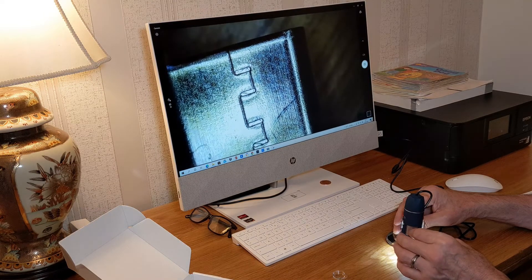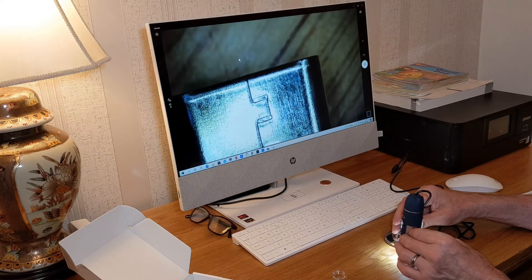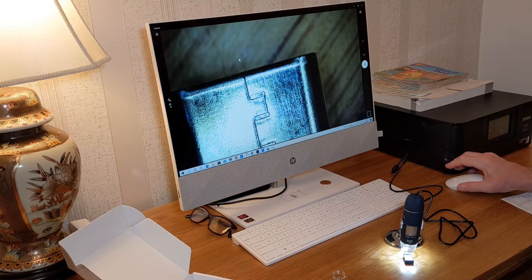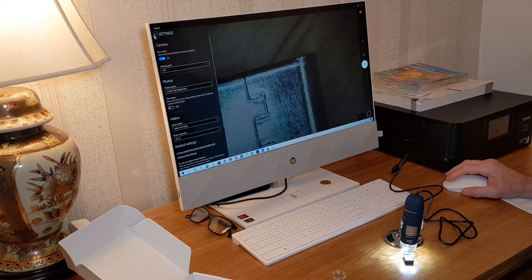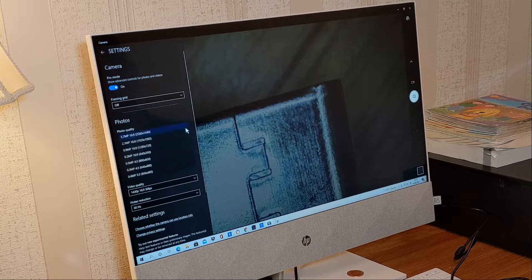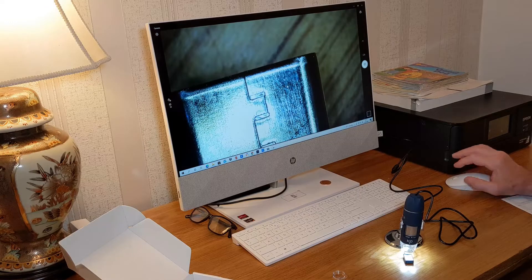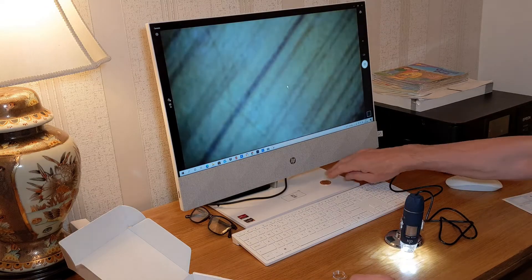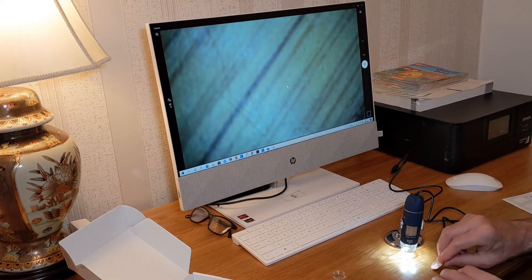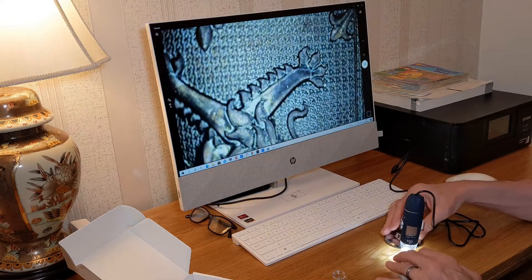And there you have it - that is pretty cool. It's a very clear image as well. If you look at the settings, I've set it at 3.7 megapixels, 2560 by 1440 - pretty much the highest setting. And that is pretty cool. I've come prepped with a coin - this is a 2p coin, there you go.